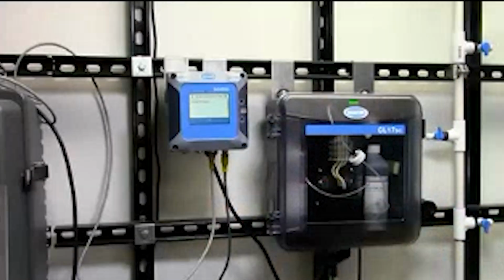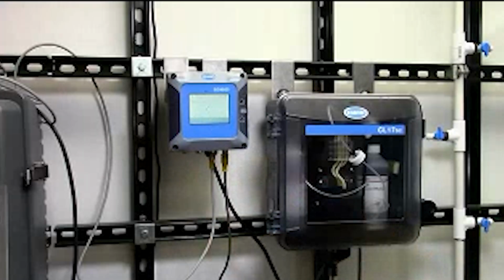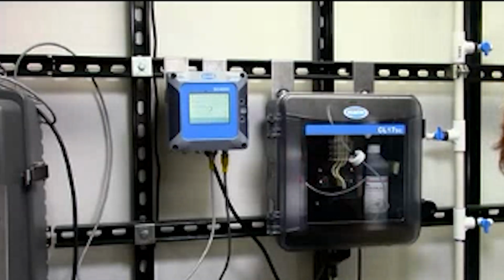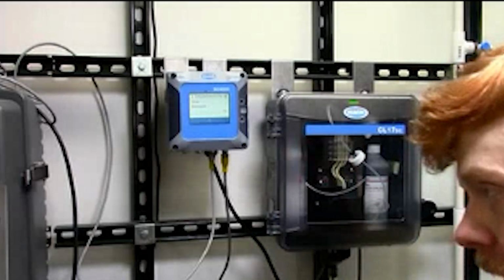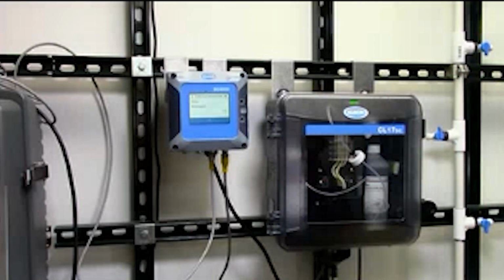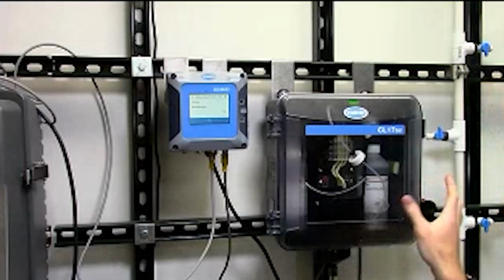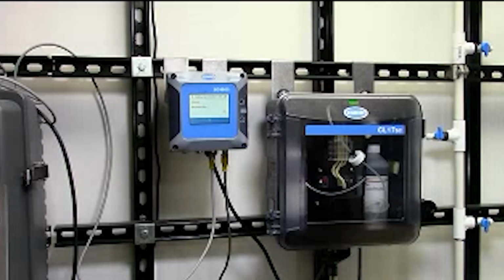Again, I'm cheating a little bit. And then I'm going to click OK. And now I'm going to be prompted that it's going to start priming. And that's going to be about a 180-second process. 3 minutes, I think, is really a lot quicker compared to, I think it was like 15 minutes with that old CL17. So that's as quick as it takes. On the legacy instruments, that process would probably take me 20 to 30 minutes, and here, much quicker.